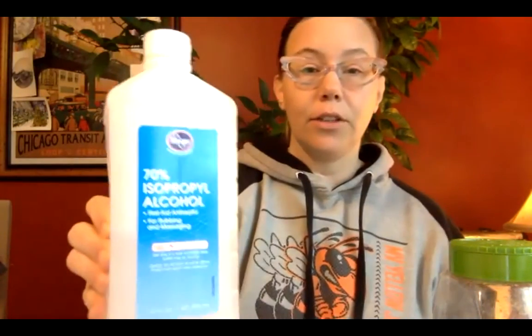For most of this, you could probably just use water. It is the universal solvent. But for most of this lab, for all our solutions, I found that just good old rubbing alcohol worked really well.